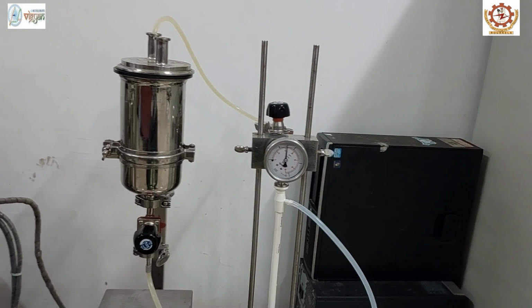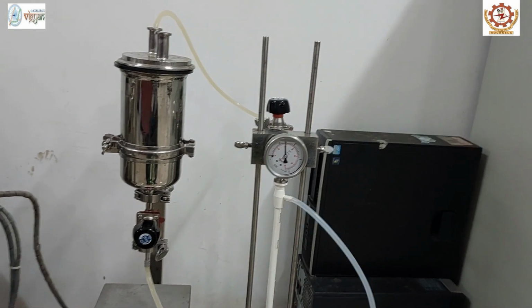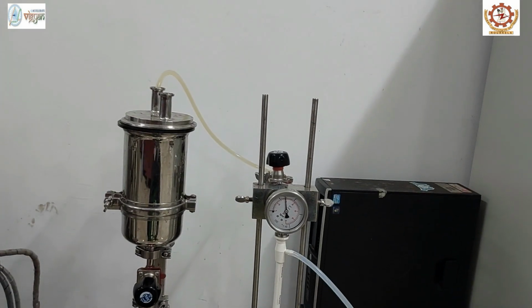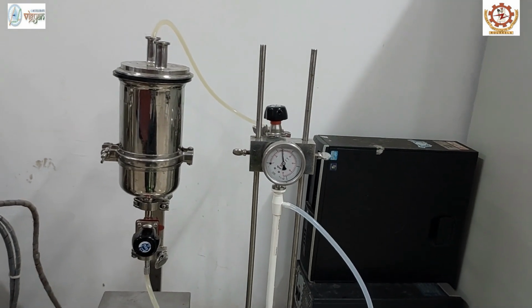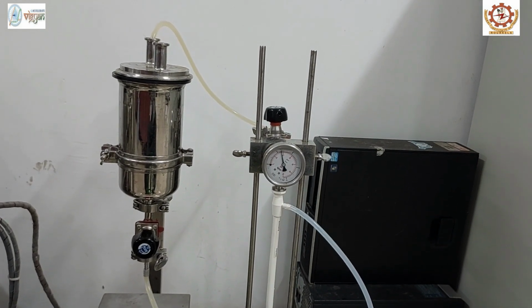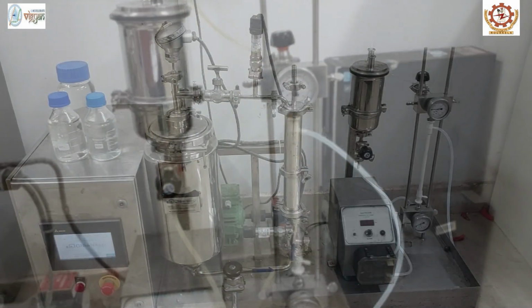After the alkali wash, again tap water will be used to rinse the membrane until neutral pH. Further, 0.1% HNO3 solution will be heated to 50 degrees Celsius and flushed through the membrane for 30 minutes at the same transmembrane pressure and flow rate. This is the acid wash that we follow. After the acid wash, again tap water will be used to rinse until neutral pH. That is how we wash our membranes after each membrane processing.